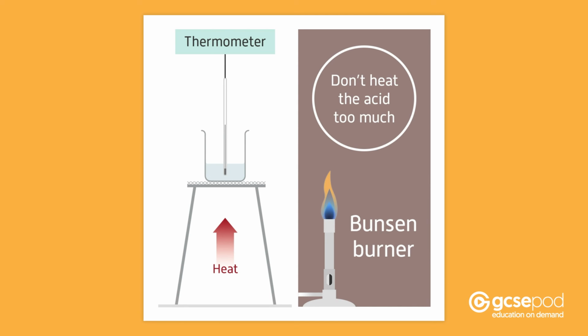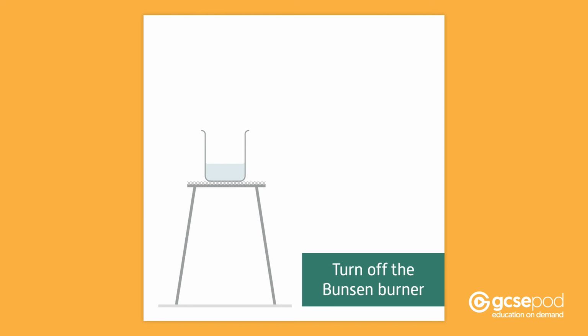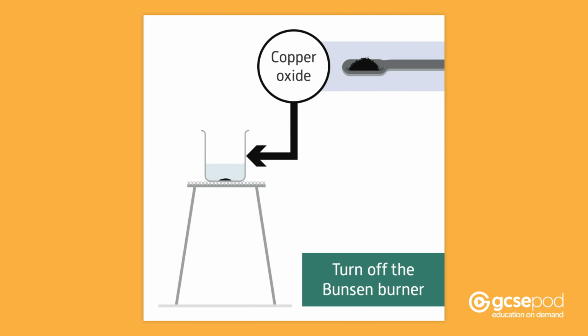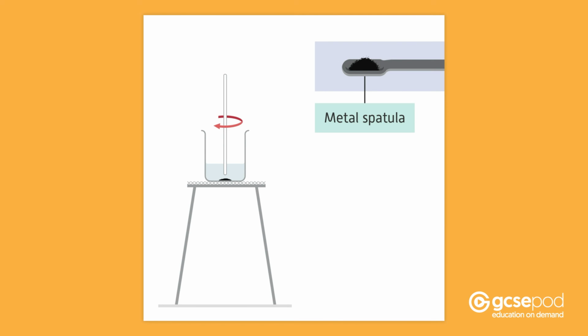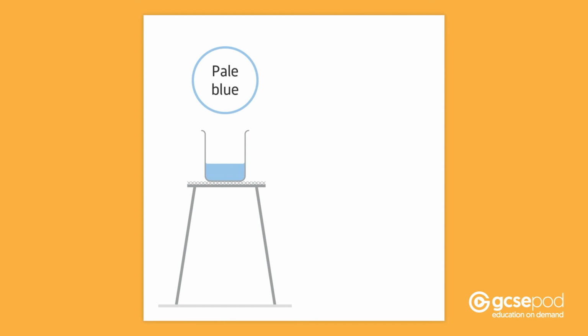It's important not to heat the acid too much, as if it is very hot, the reaction with copper oxide will be more vigorous and create a foam that could spill over the sides of the beaker, which is a hazard. Now turn off the Bunsen burner and add a spatula of copper oxide to the acid and stir. Use a metal spatula to transfer the oxide and a glass stirring rod to stir the mixture. The copper oxide will react with the acid and form soluble copper sulfate, which has a blue colour. You will see the solution turning pale blue as the black oxide reacts and disappears.